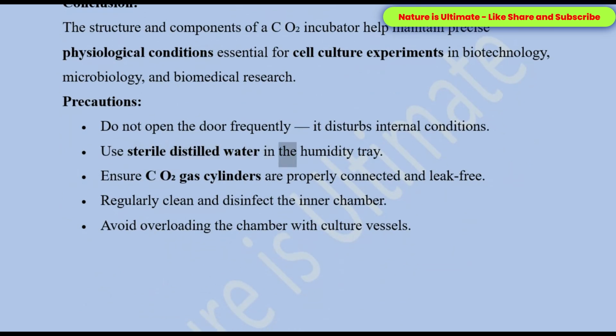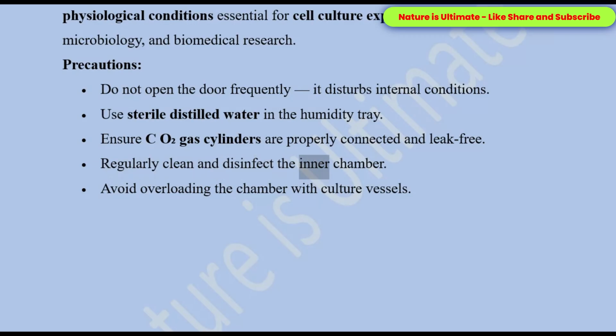Use sterile distilled water in the humidity tray. Ensure CO₂ gas cylinders are properly connected and leak-free. Regularly clean and disinfect the inner chamber. Avoid overloading the chamber with culture vessels.